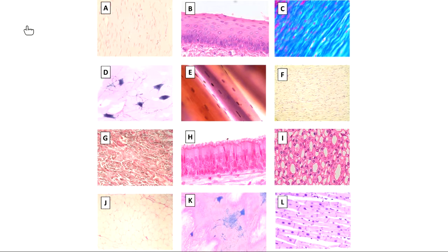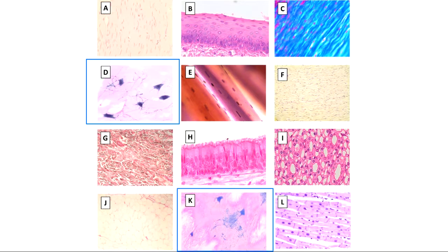Yeah, so a bunch of us are in. I have two places with nervous tissue. First place that most of us are agreeing on, D, that shows me nervous tissue. And the other one that several of us noticed is K, that's nervous tissue there as well. So when I'm looking at my types of tissue here, nervous tissue is the one type we haven't talked about at all yet. Let me zoom in a little bit just to show you.